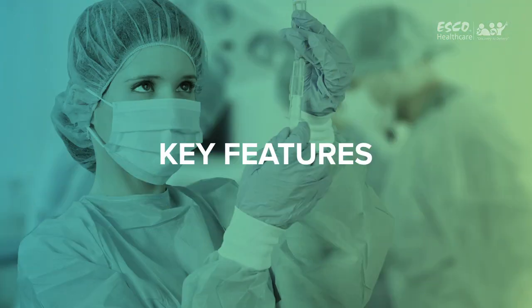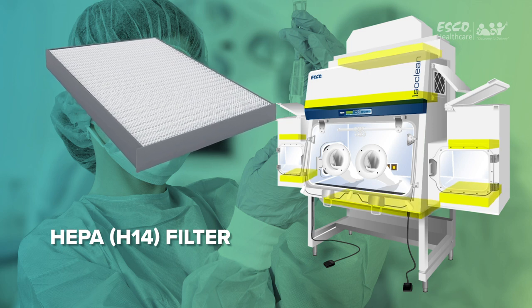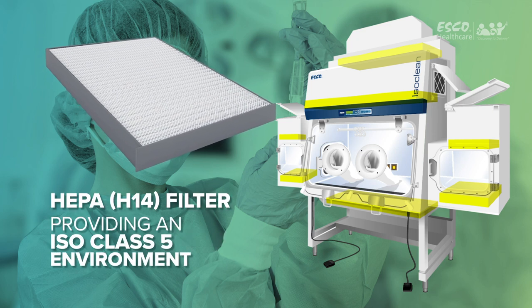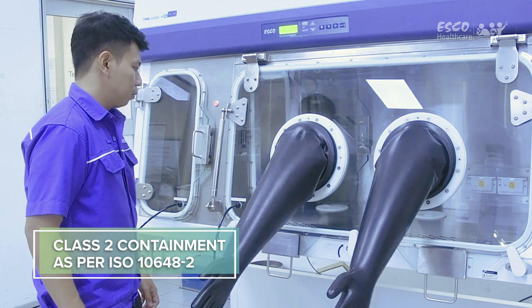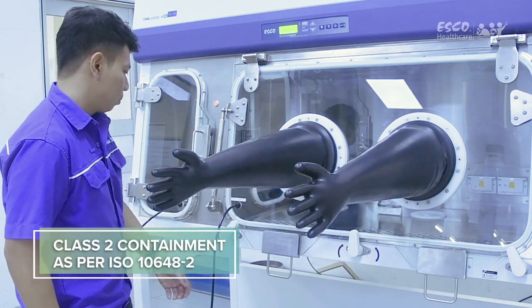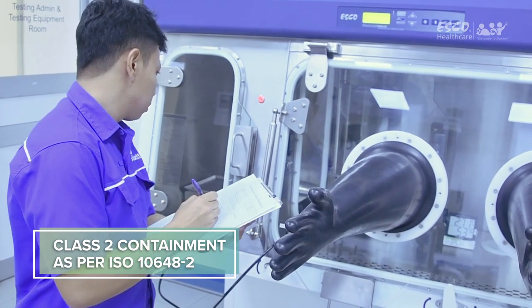Key Features: HEPA H14 filters with a typical efficiency of 99.999% at 0.1 to 0.3 microns provide superior IsoClass V air cleanliness. Class 2 Containment per ISO 10648-2 pressure leak testing, assuring you of a leak-tight chamber and operator safety.